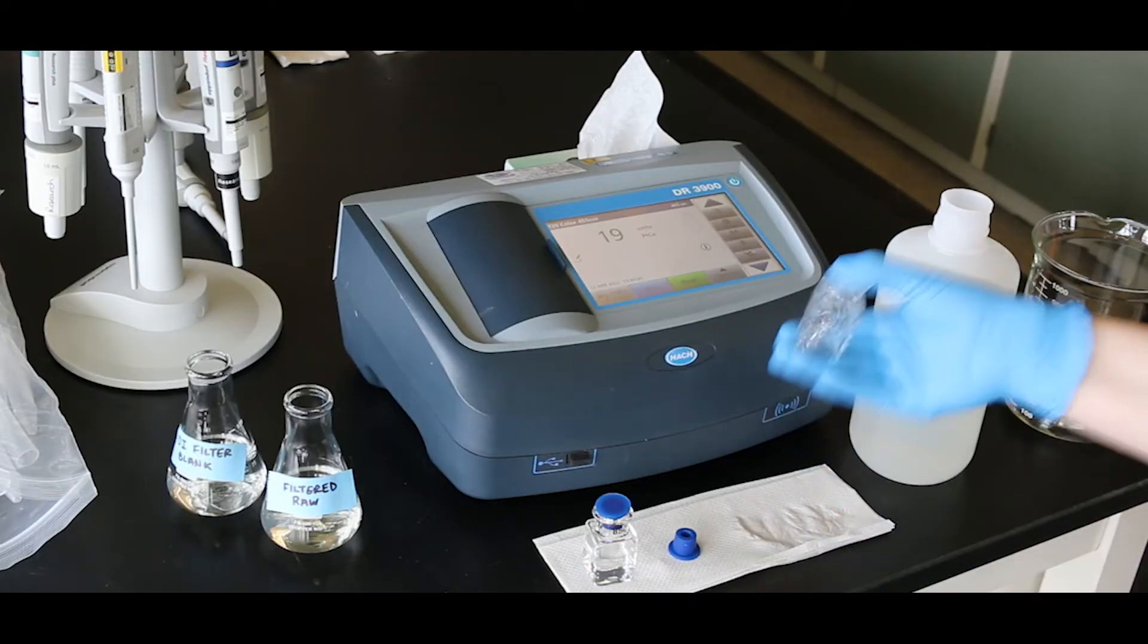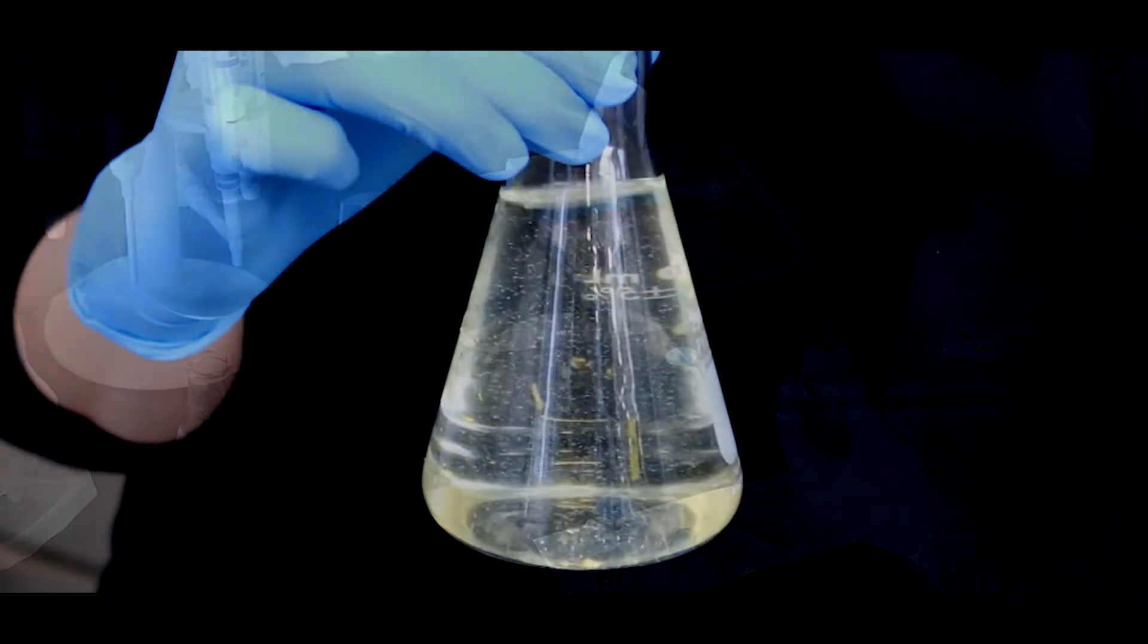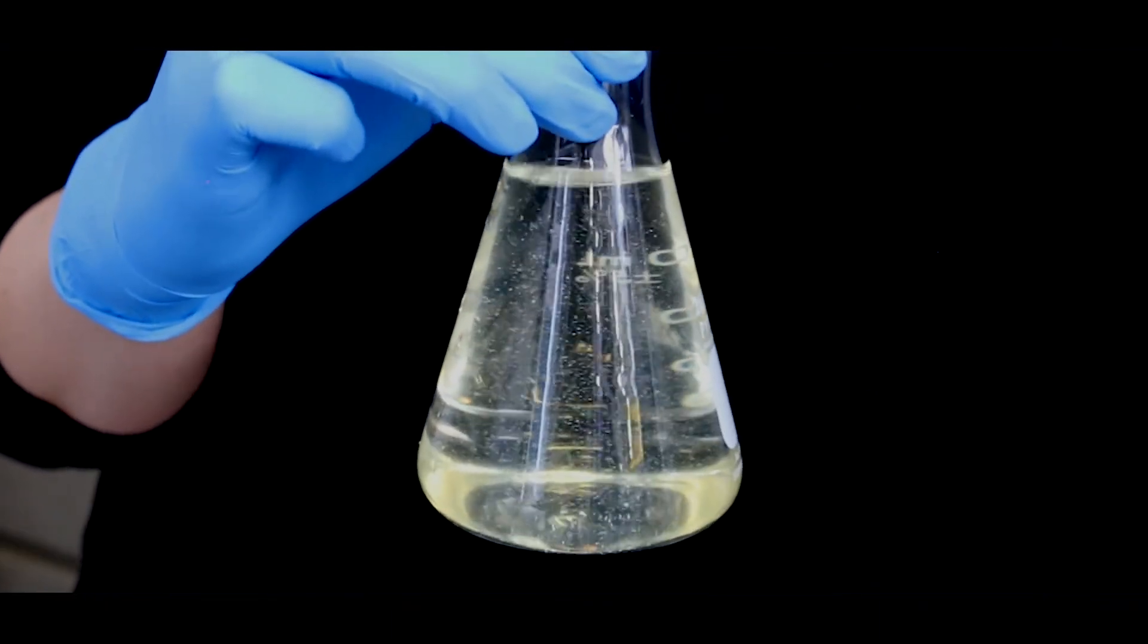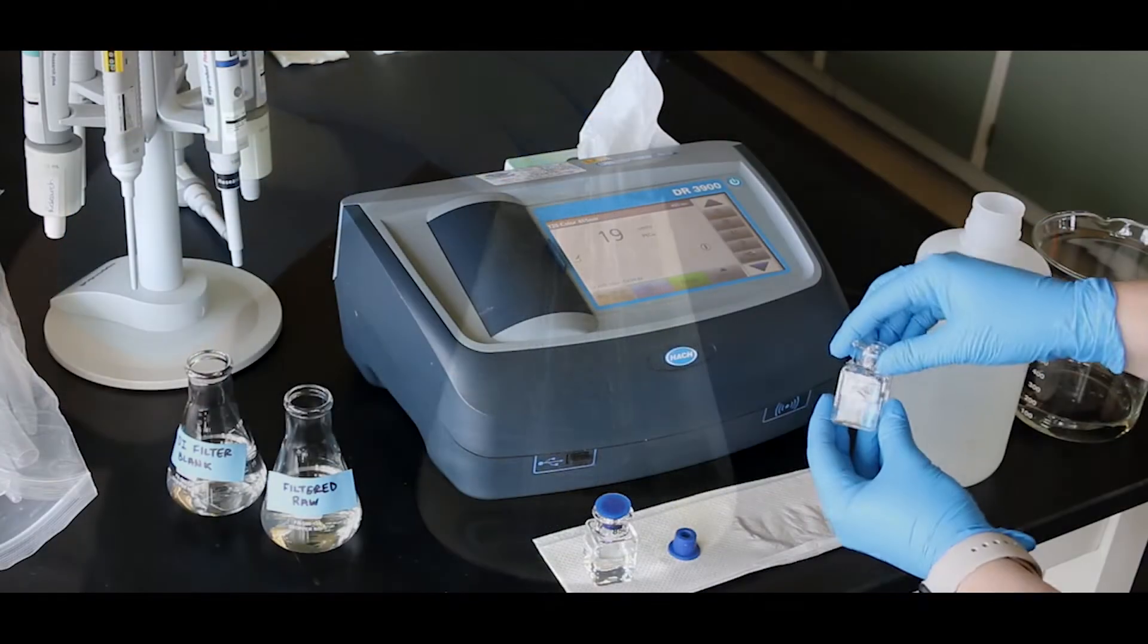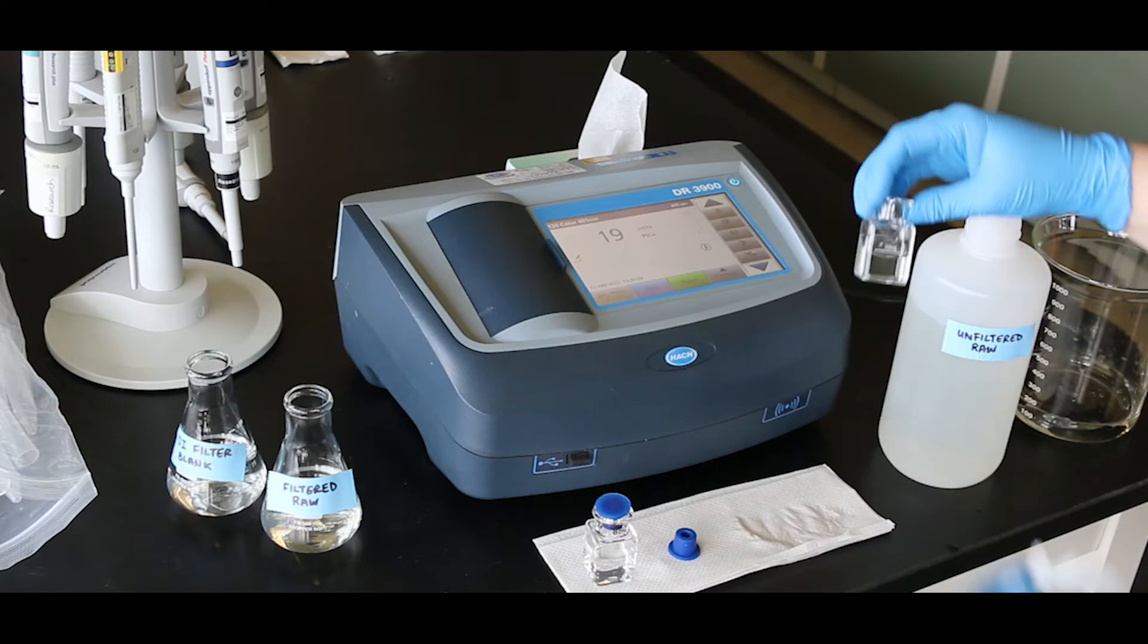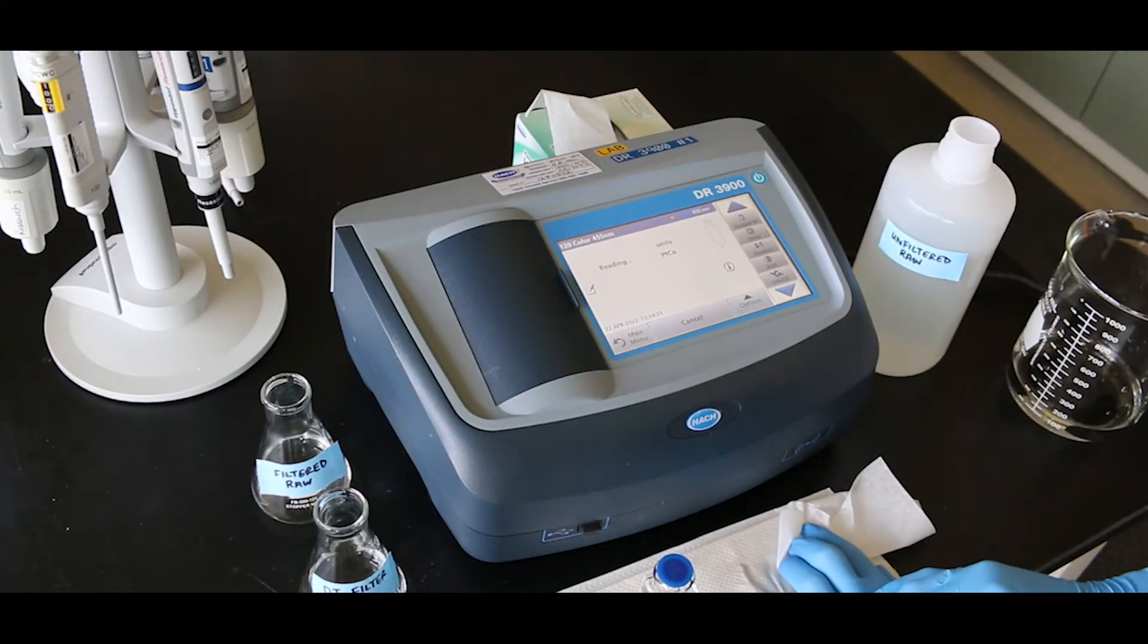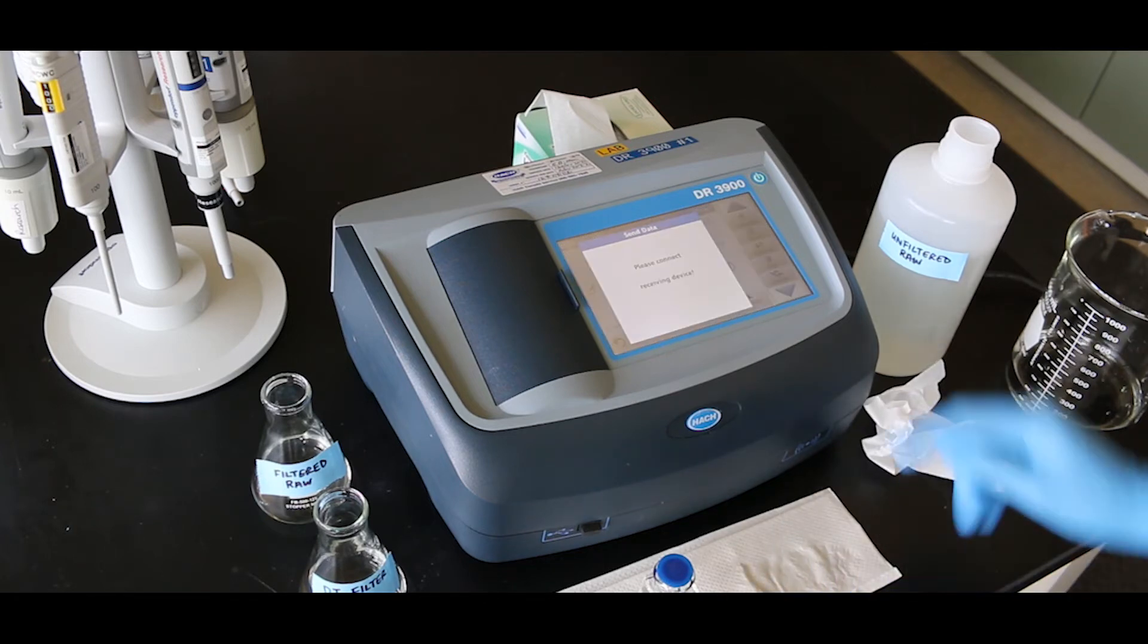Prepare the sample by rinsing and filling with the sample water. Be sure to agitate the sample water if it has been sitting to re-suspend the matter. Clean the outside of the sample cell and insert it into the instrument. Press read. This value will be your apparent color measurement. Record the results in platinum-cobalt units.